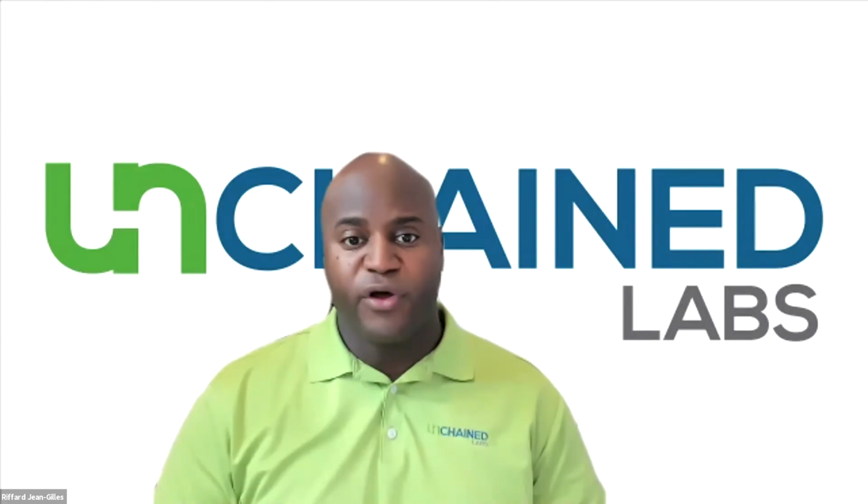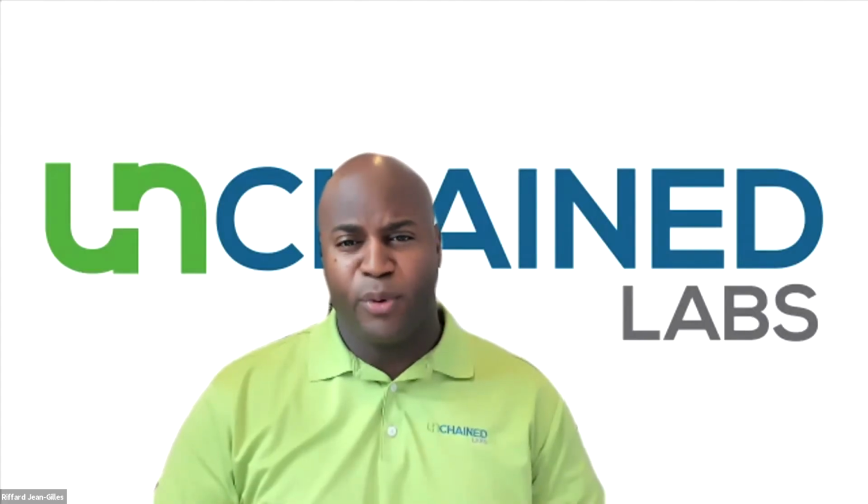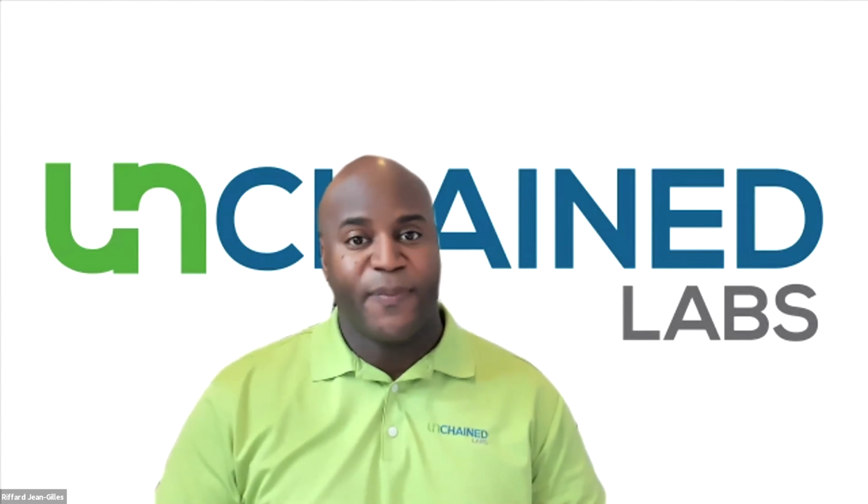Let's see, so I know you've covered this a bit before, but why does DLS matter? Isn't SLS enough? DLS is really important because it actually gives you a quantitative answer on size. Usually hydrodynamic diameter is the main metric that we're talking about, but there's a large suite of metrics that come out of DLS results.